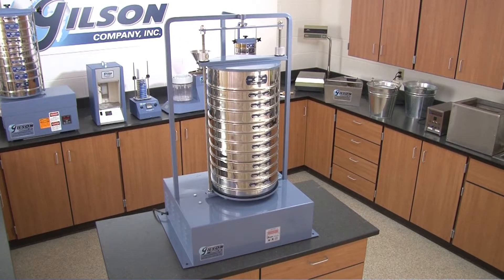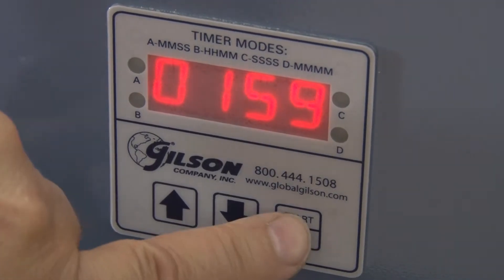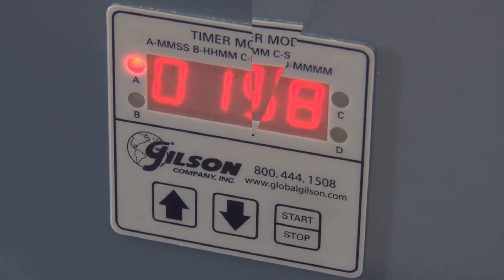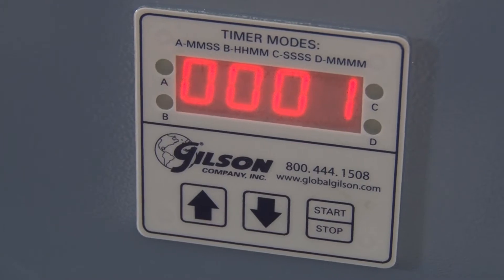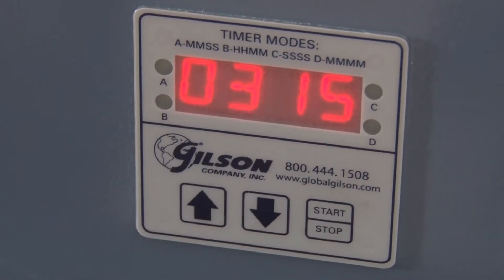The popular SS14D features a digital timer with a large LED display and a mid-cycle pause function. For convenience, once the cycle is completed, the timer will automatically reset to the desired test time.